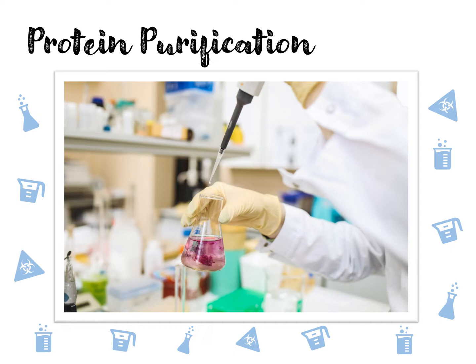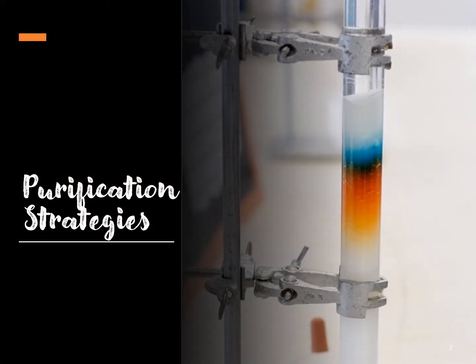So we did look in detail at the different techniques of cell lysis, what the advantages and disadvantages of each are, and when to select one over the other. And we also talked about ammonium sulfate precipitation and centrifugation and the different types of centrifugation, their principle, and so on. So in this particular lecture, we are going to talk about the final step, which is chromatography.